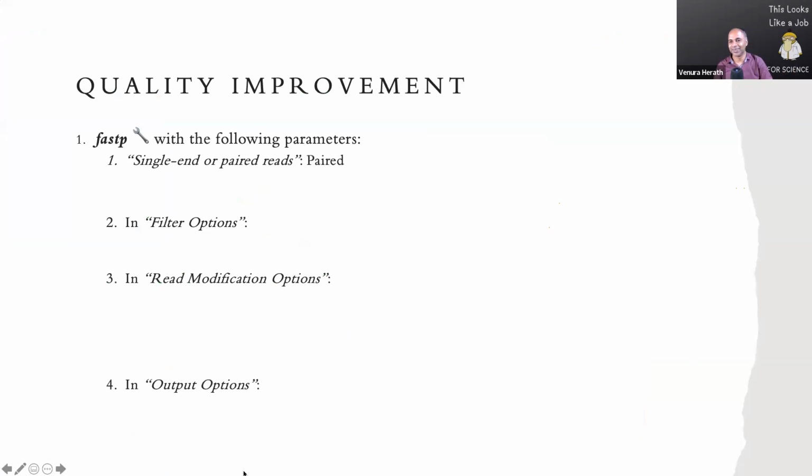Okay, so now go ahead and load the FastP from your toolshed, and then see whether you see your dataset. Go ahead first, and then I will give you the options you need to pick. Now it's not like the input one, input two, like last time. Here you can load your paired collection. So go ahead and load it.